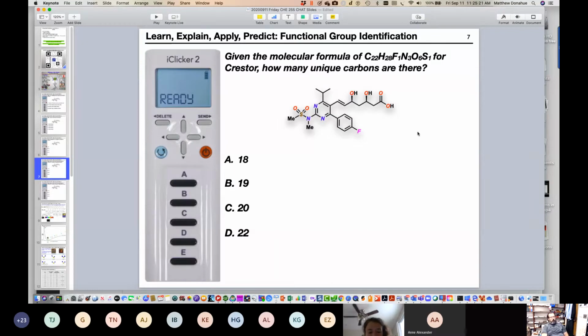Okay, so the question was, there's 6 carbon atoms, how many should we count? I saw a couple answers of 4. 4 is the correct answer. If you're standing right here where the mouse is pointing, you see that carbon atom bears no hydrogens, right? So that's 1. When you look out here and you look out there, you see the same thing.